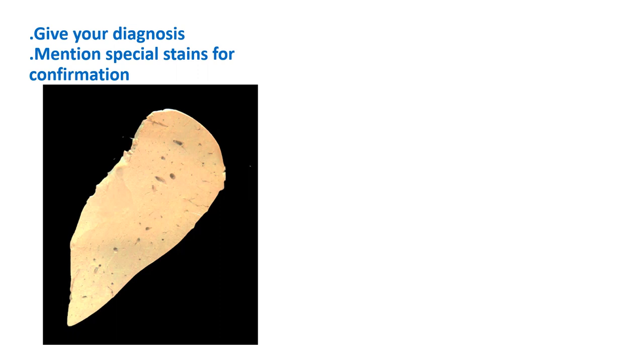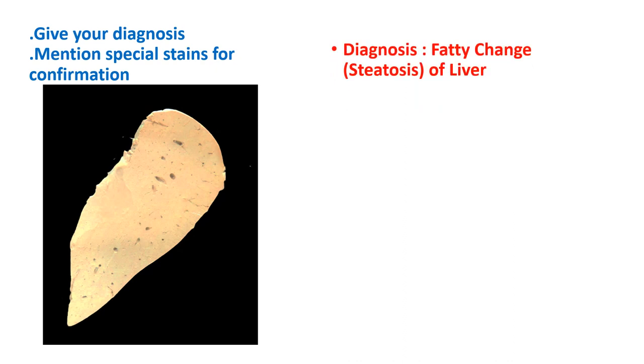This is again a slice of liver showing similar features — pale yellow color and a glistening capsule. So this is also a fatty change. An important question that may be asked is to mention the special stain for confirmation of this particular change. The diagnosis is fatty change, steatosis of the liver.